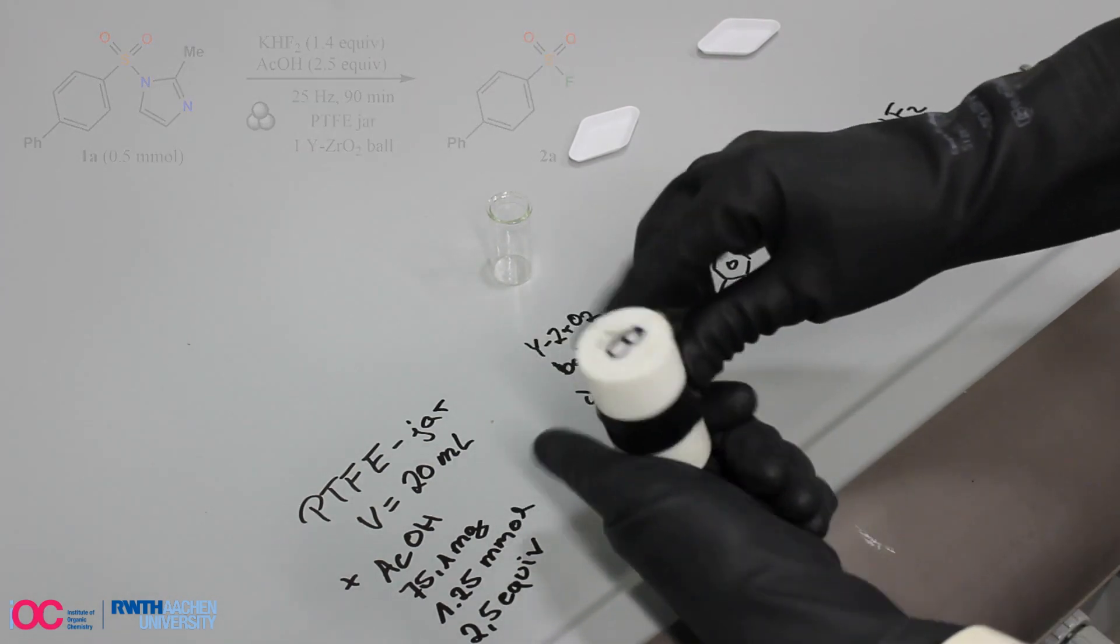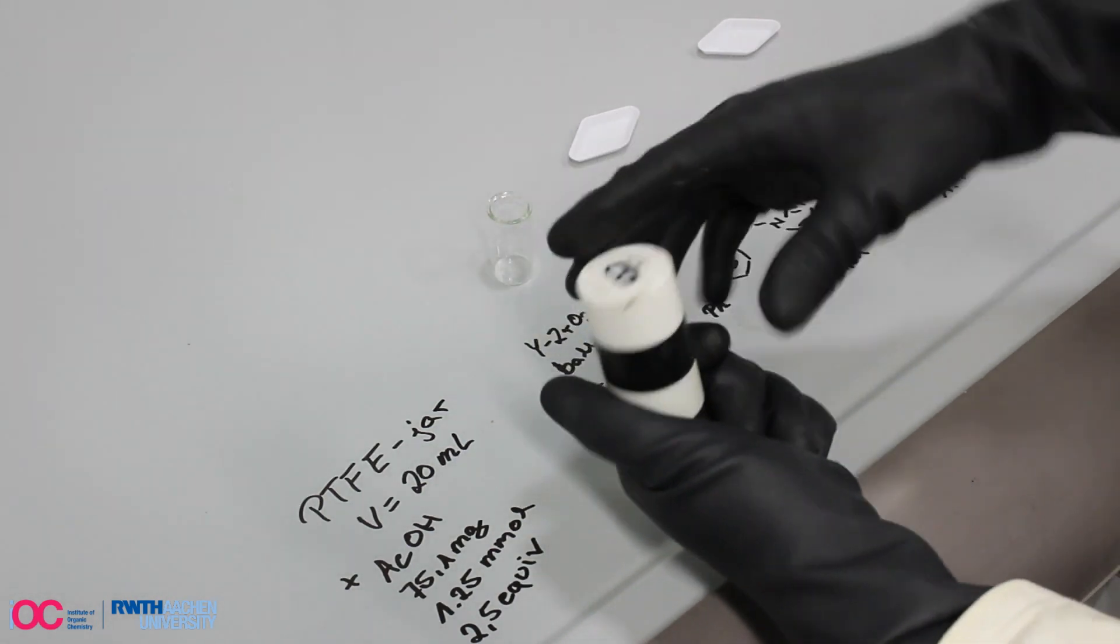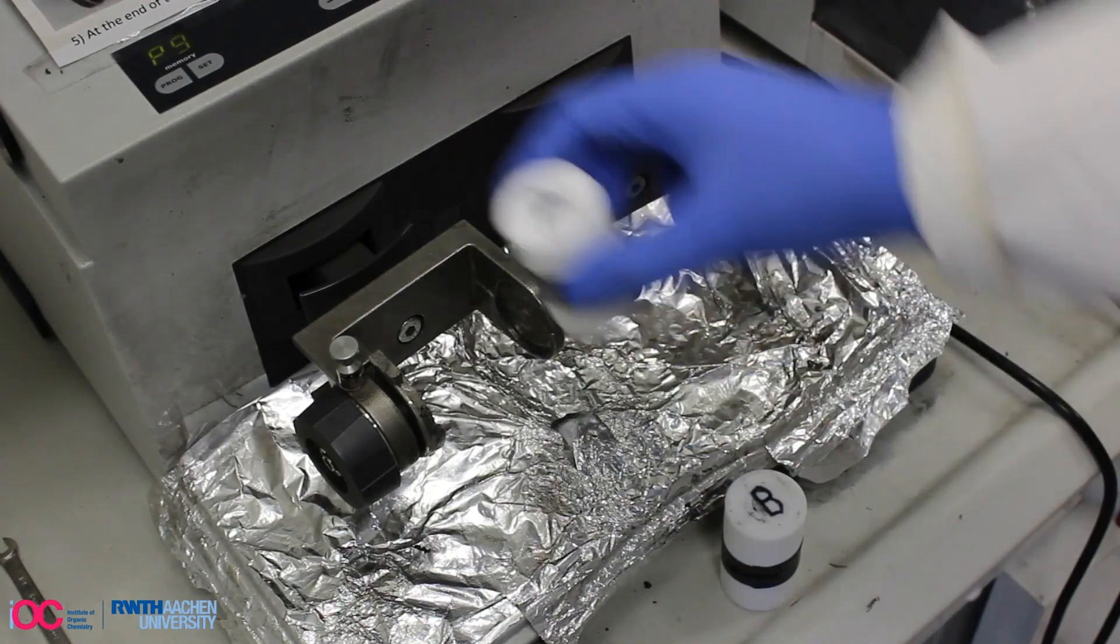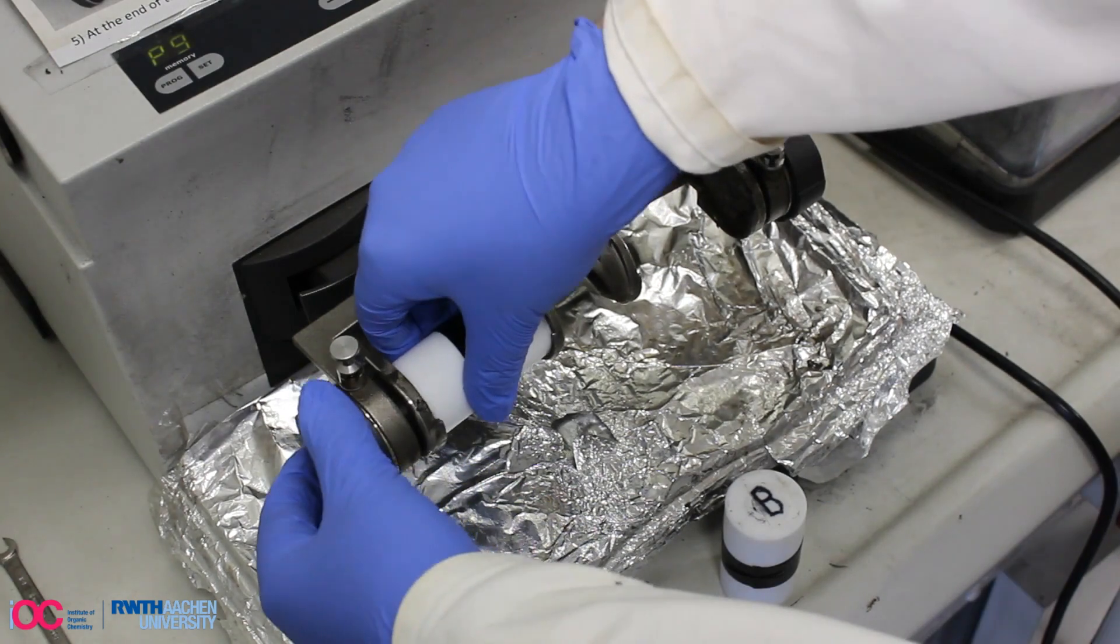The jar is immediately closed and additionally sealed with an insulating tape. Now the jar is mounted onto the holder of the milling device.